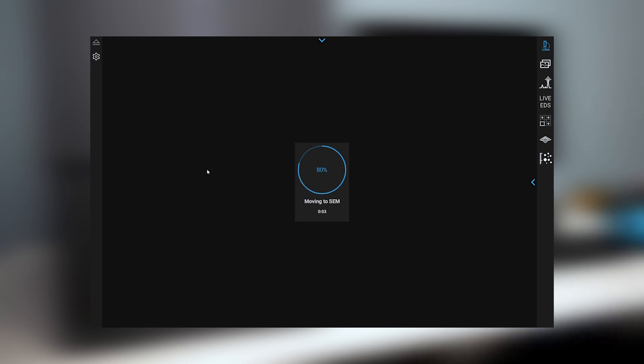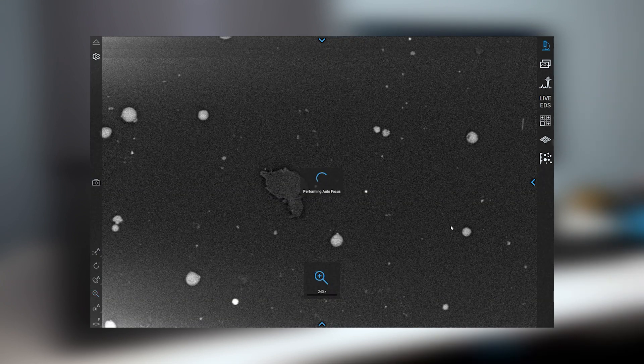An auto focus and an auto contrast brightness procedure is run to provide the user with a quick SEM image on the screen.